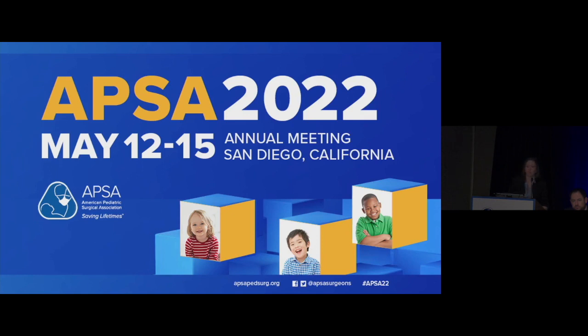Yes, it's a good question. But amazing work, so thank you very much. Thank you. So yeah, the resolution all depends on the size of the nozzle that you're printing with. So you can actually get down to a 25 gauge needle, and that will give you a resolution of about 100 microns. So, I mean, the technology is definitely advancing. I think with the stereolithography-based approach, you can actually get better resolution. But with the 3D bioprinting approach, the best you can get down to is 100 microns.